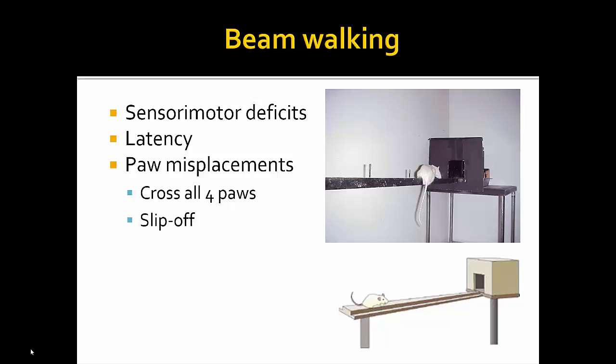Yeah, that apparently can cause a phase shift, though, can't it? Cause of jet lag. Just even having that flash, is that right? Not for the amount of time. No, yeah. How long is the task? 5 minutes? Yeah, because you do like 3 trials. They rest in the box for like 30 seconds. It takes you about 5 minutes to run the trial.